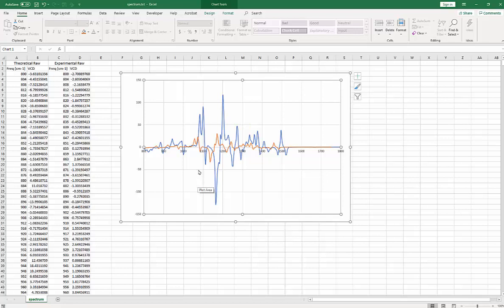The other thing that you notice is that the spectrum seems to be offset. See these two peaks right here? The blue is a bit higher frequency, so these need to be shifted back to align with these two peaks that we see here. And this is quite common, that the theoretical spectrum coming from an electronic structure calculation will give frequencies that are just slightly higher. It's because of the harmonic approximation, and you have to scale them back by a little bit here.